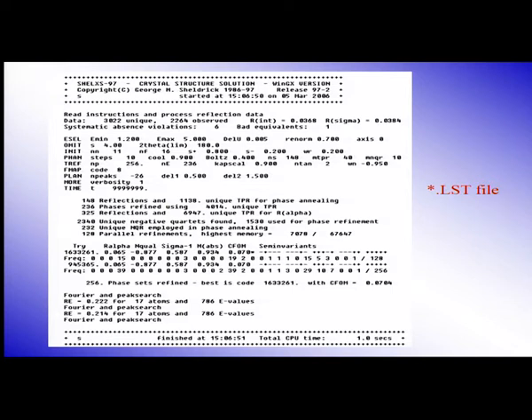By the structure invariant definition H plus K plus L equal to 0, I mean all the H's add to 0, all the K's add to 0, all the L's add to 0, which means 3 equations are simultaneously obeyed: H1 plus H2 plus H3 has to be 0, K1 plus K2 plus K3 has to be 0, and L1 plus L2 plus L3 has to be 0.